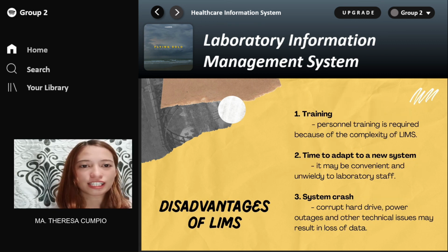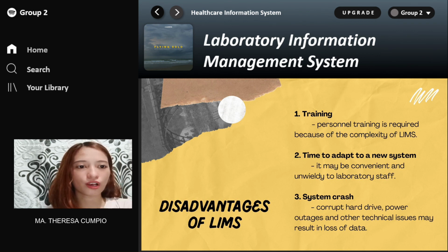So, what are the disadvantages of LIMS? The first one is training. LIMS training is important for a number of reasons, whether it's learning how best to configure the LIMS for an efficient startup, or helping the key users maximize its daily use. So training is a key element to both a successful implementation and effective continuing daily use of the LIMS.